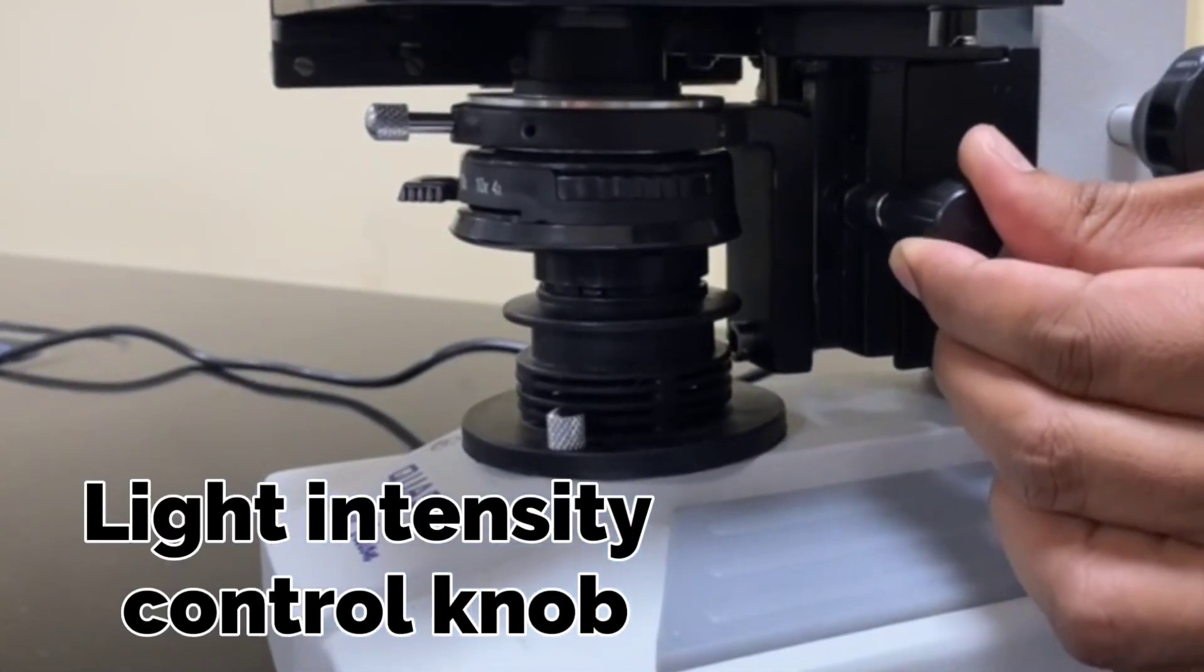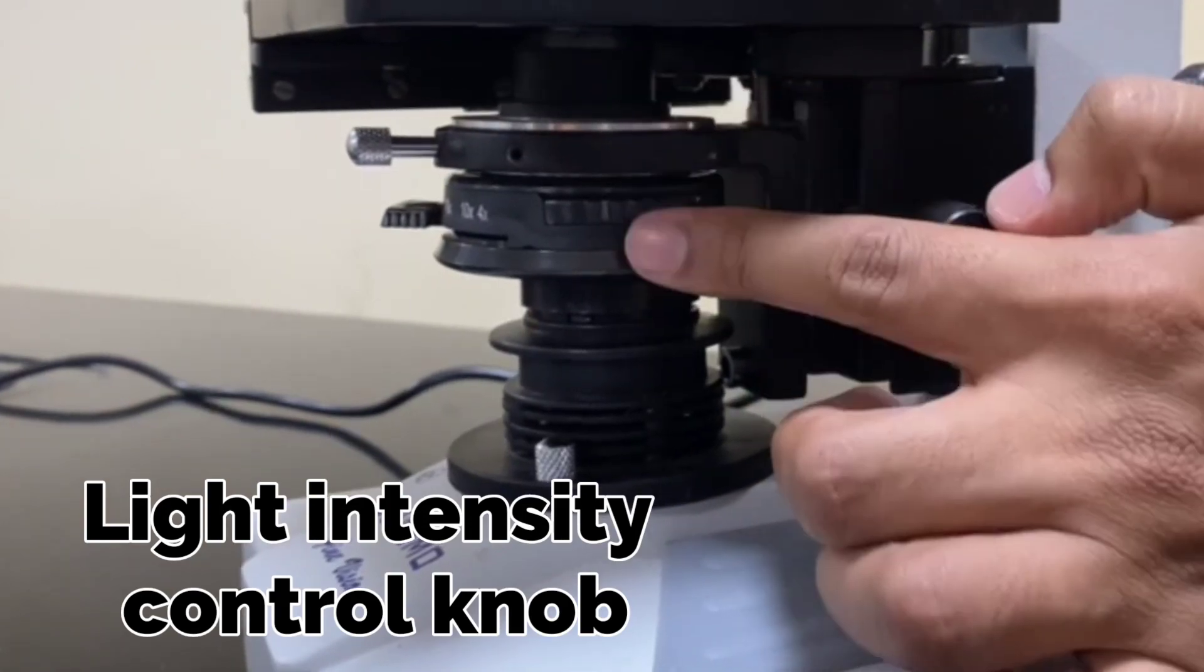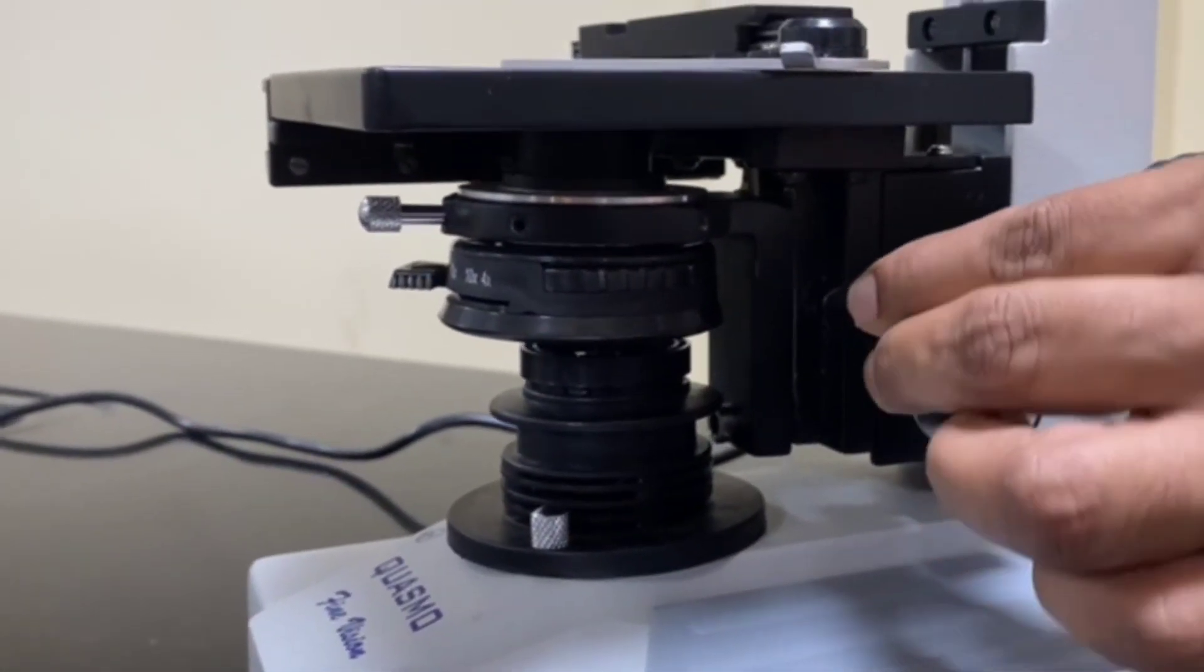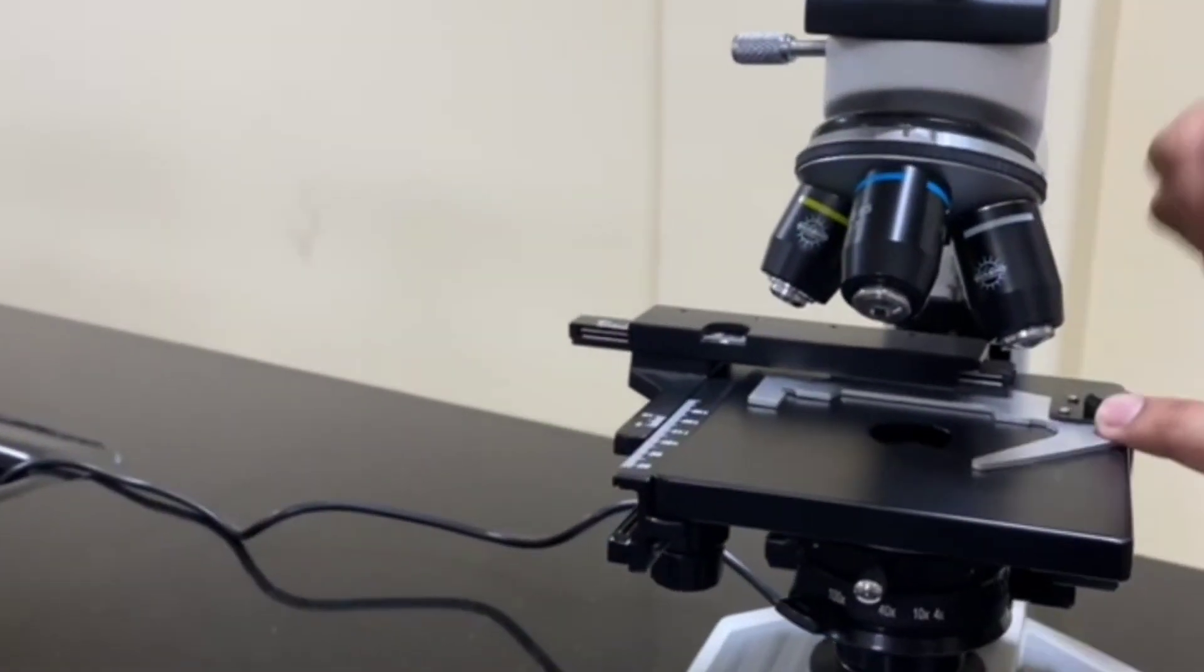Now this light intensity control knob can be used to move the diaphragm up and down and you can control the intensity of light from here also. Now come to this portion of the compound microscope.